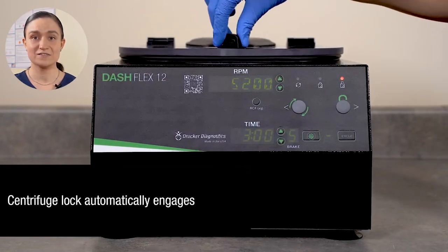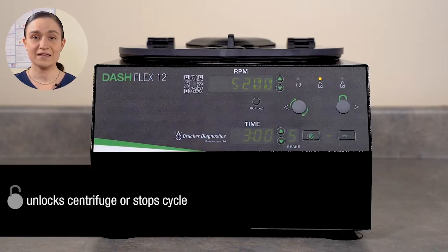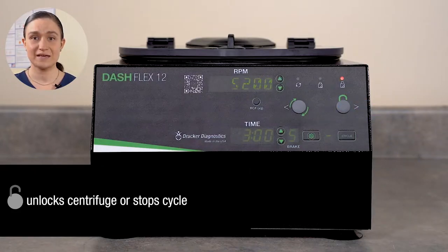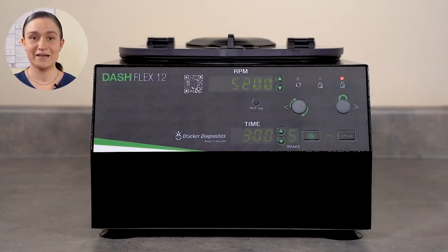The lid will stay unlocked for 60 seconds — one minute. After that, it will lock again. If the lid is locked, you can unlock it with the Stop Unlock button. If the centrifuge is running, this button will stop it mid-spin. If it's not running, this button will unlock the lid.